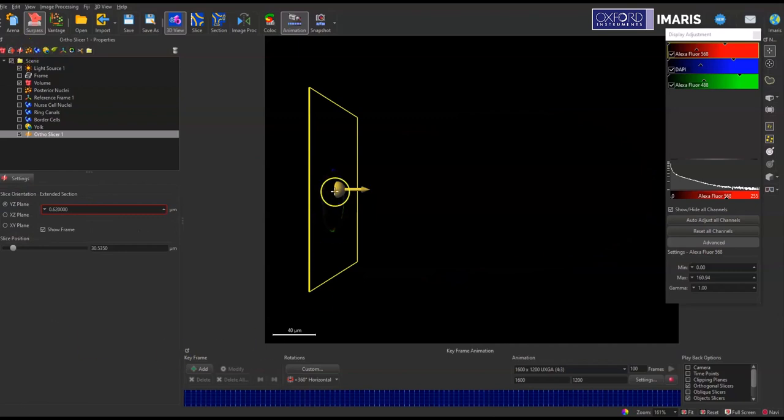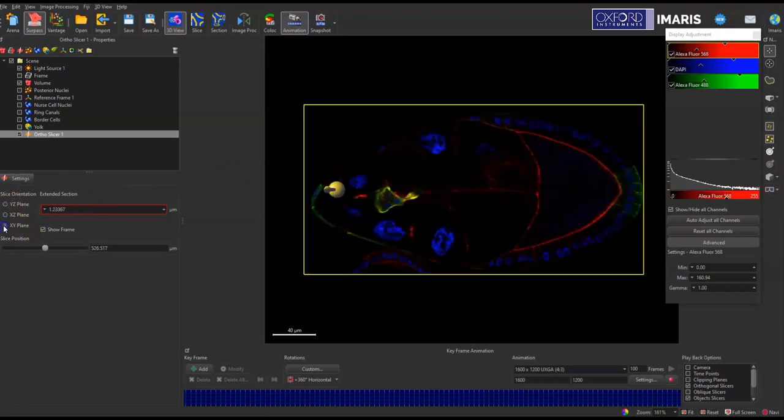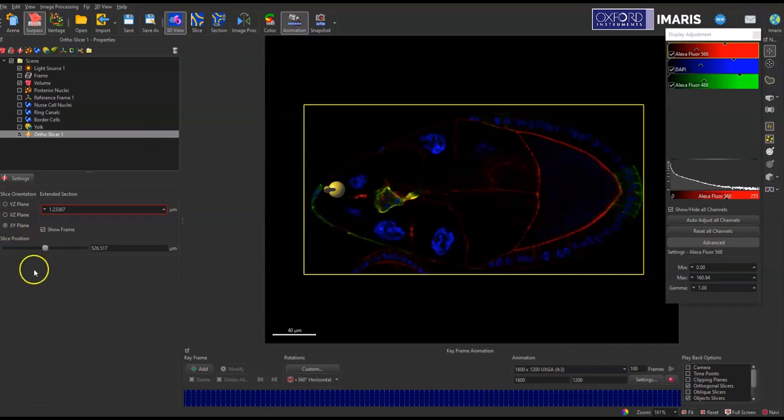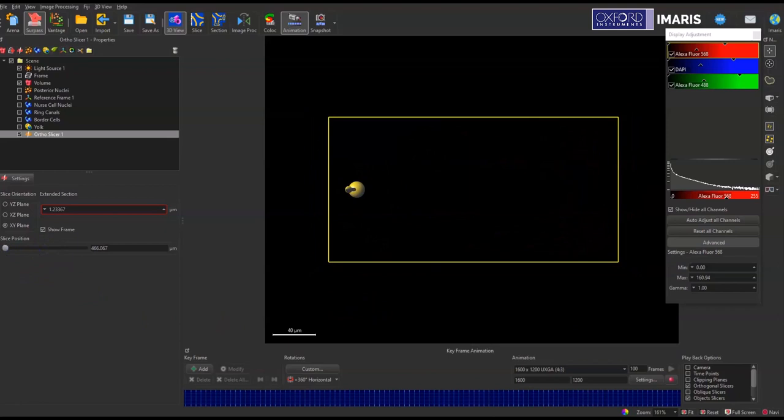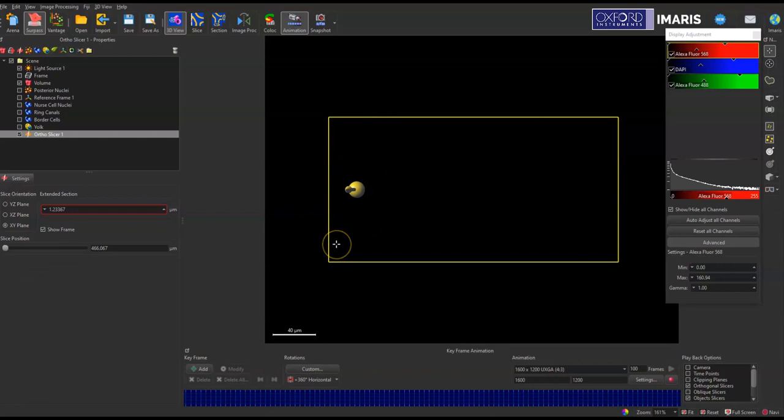I can have my slice orientation be any of these different planes. I will do the XY plane so it's going through and showcasing the Z-Stack. I'm going to start at the very bottom slice position and you can see there's this yellow ball and arrow. For most animations, you probably won't want that in your recording.